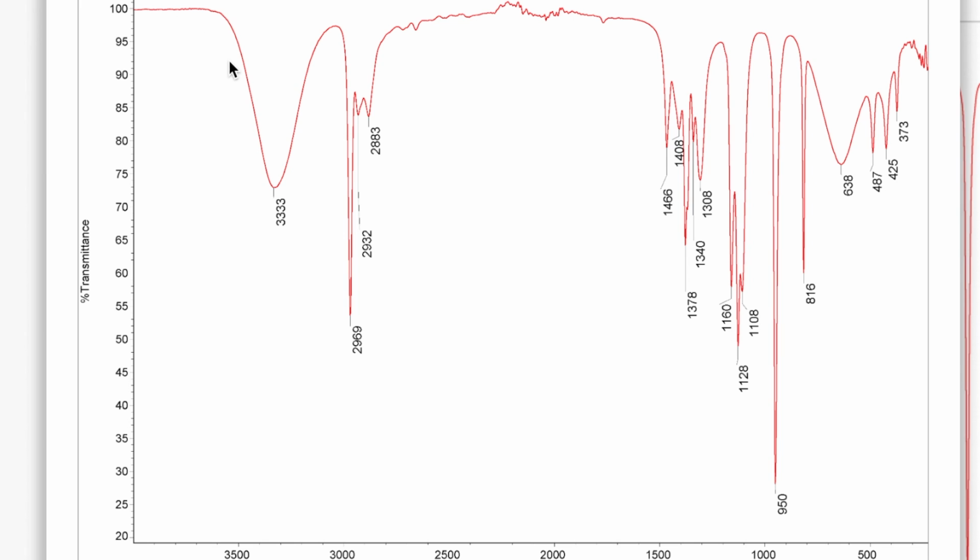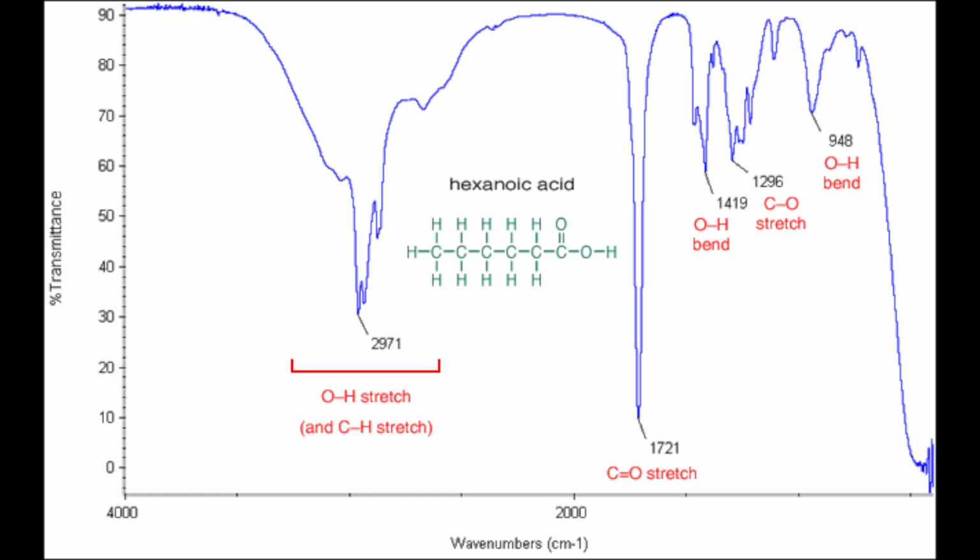The easiest and most notable peak are the alcohol peaks, which are around the 3600 to 3200 region, and they're very broad. Carboxylic acids are around the 2500 region to the 3000 region, and look very similar to alcohol peaks, except for the fact that you can see some points sticking out from it, so it makes the whole peak look like a beard. The other way you've seen the carboxylic acid peak look like is a really jagged plateau. Both shapes are unique and identifiable to carboxylic acids.